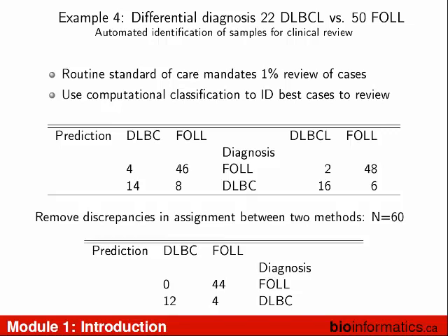And so we can do stuff like clustering, and we can find populations, and we can train. I'm not talking about the classifier that we developed. I don't think we're talking a lot about classifiers in this, but there's a lot of statistics you can do that we're not talking about that are outside of analyzing flow structured data. So a lot of what we're talking about over the next few days is the nitty-gritty of how to read in an FCS file, the nitty-gritty of how to do population matching. But there's all the statistics that come after that, like how do you do classification, how do you do t-tests, how do you look for differences. So we can do that here.